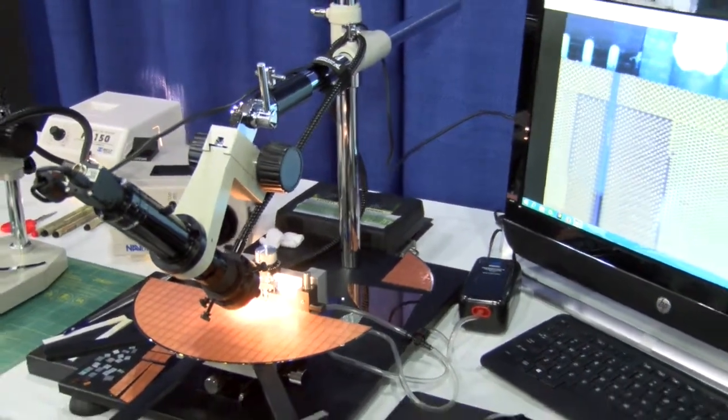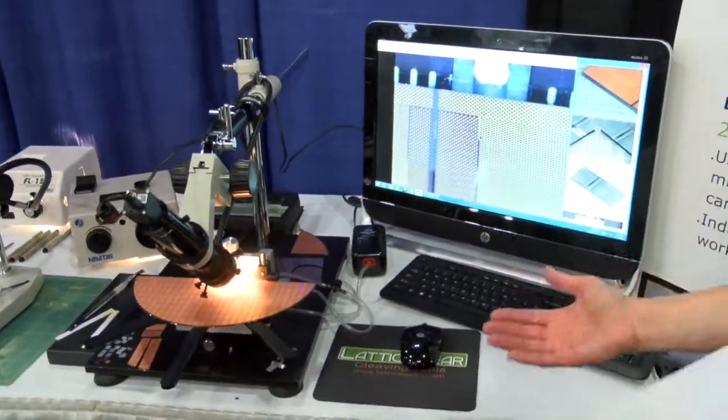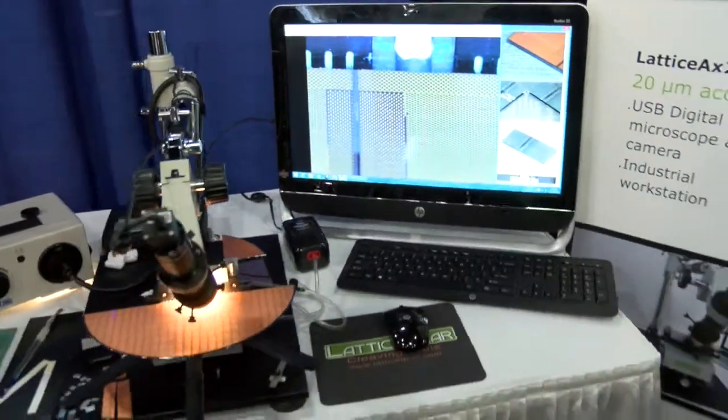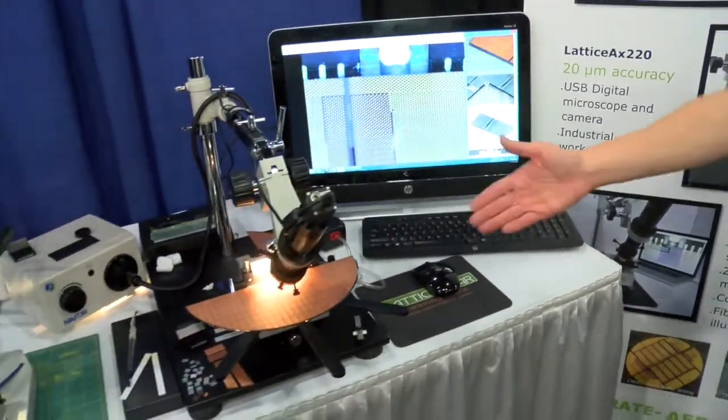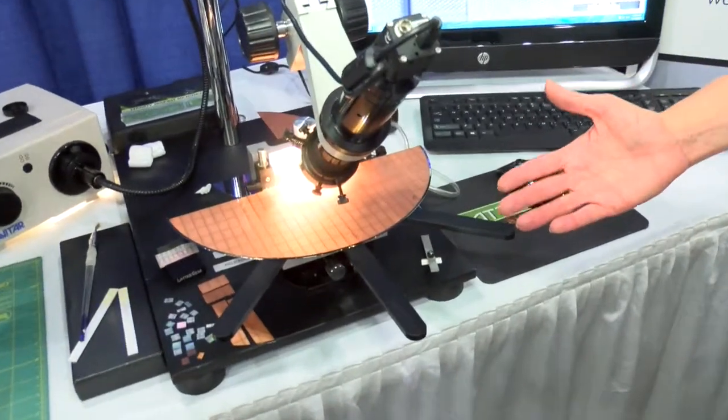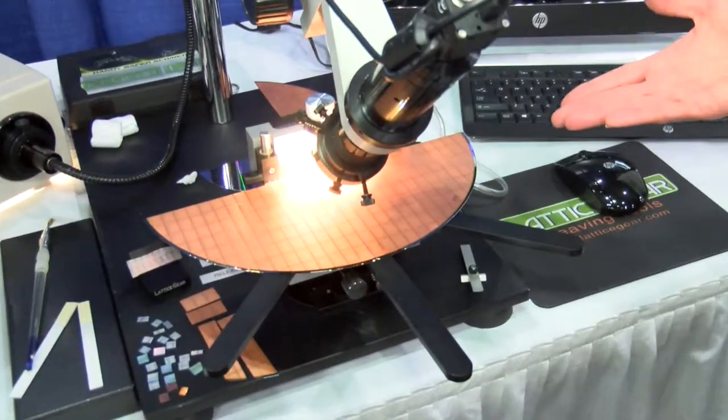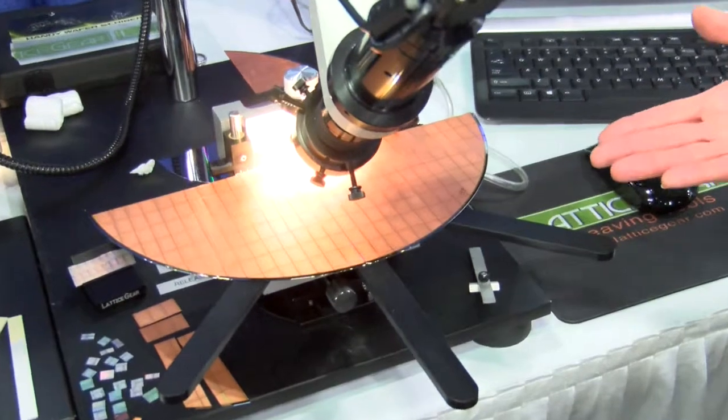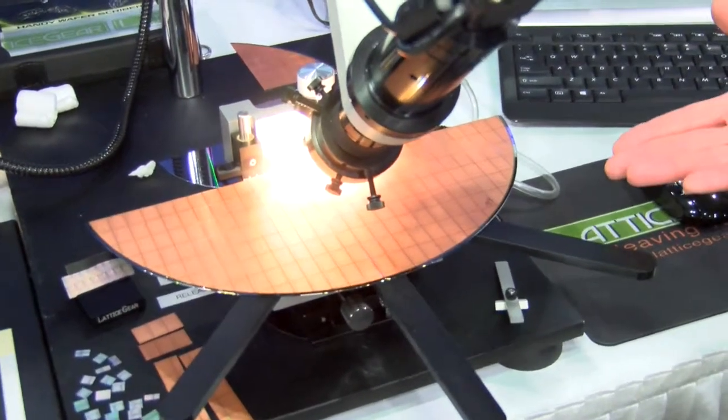This year 2014 we would like to introduce you to two new accessories. This accessory is our large sample platform for the LatticeX that allows to cleave samples as large as 300 millimeter wafers.